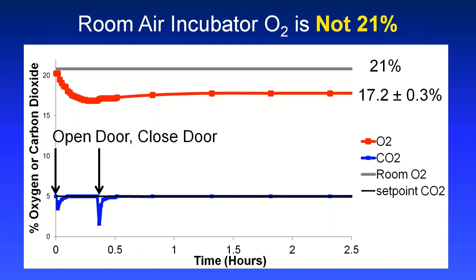And if we left the sensor in there for long periods of time, say, over a weekend, after 2-3 days, we would get close to that 18.6% that's calculated for what the oxygen should be in there. So if you're looking to set your whole Xvivo system to the same conditions as you have in a room air incubator, I'd suggest 18% oxygen.